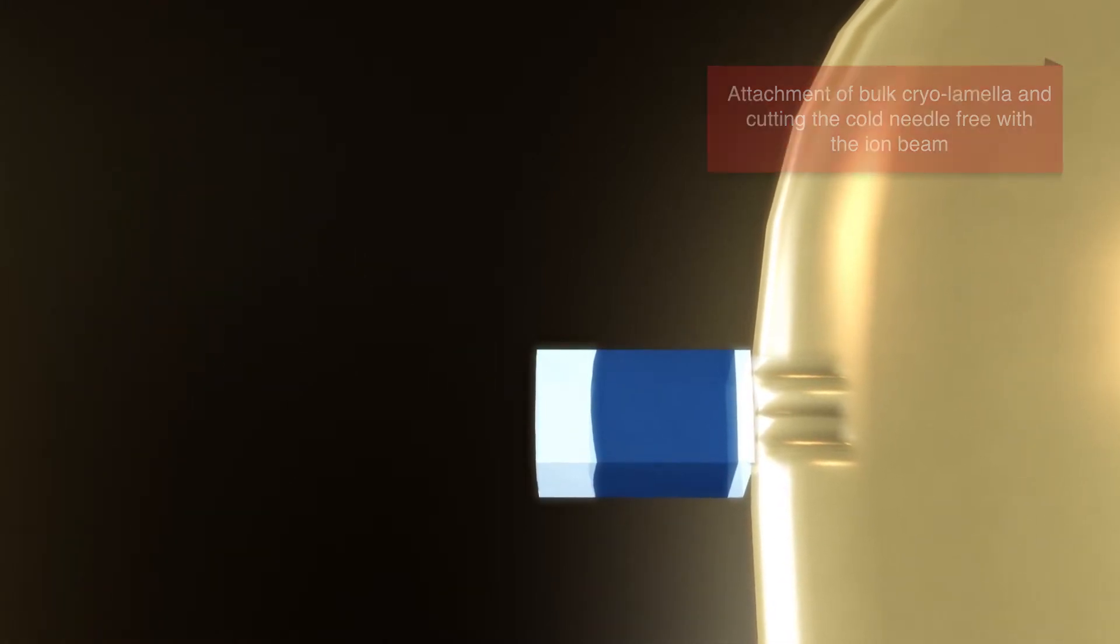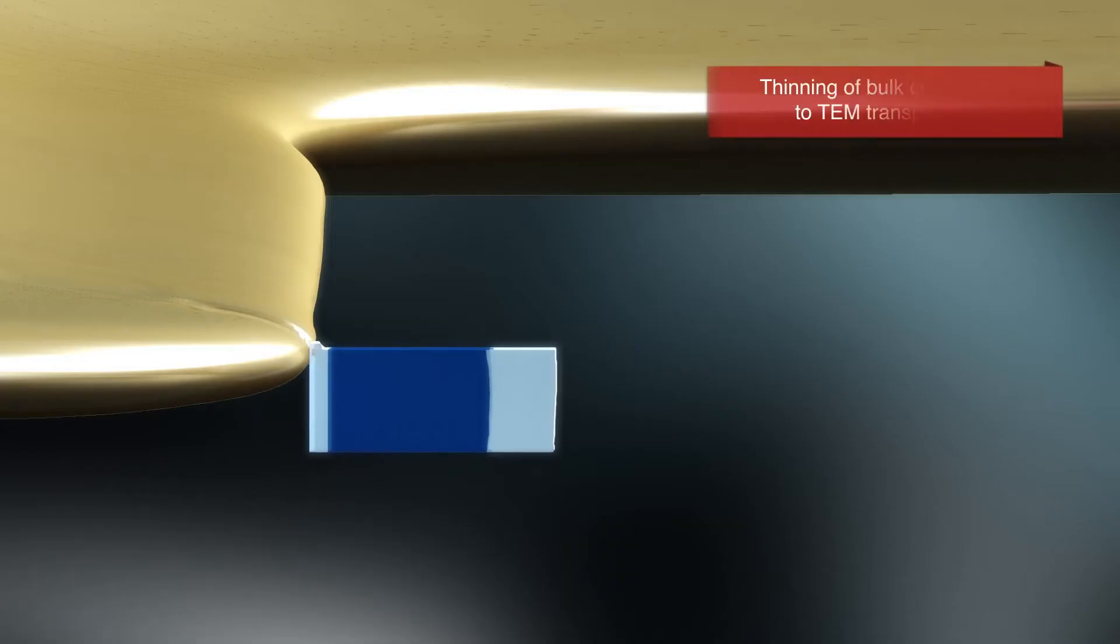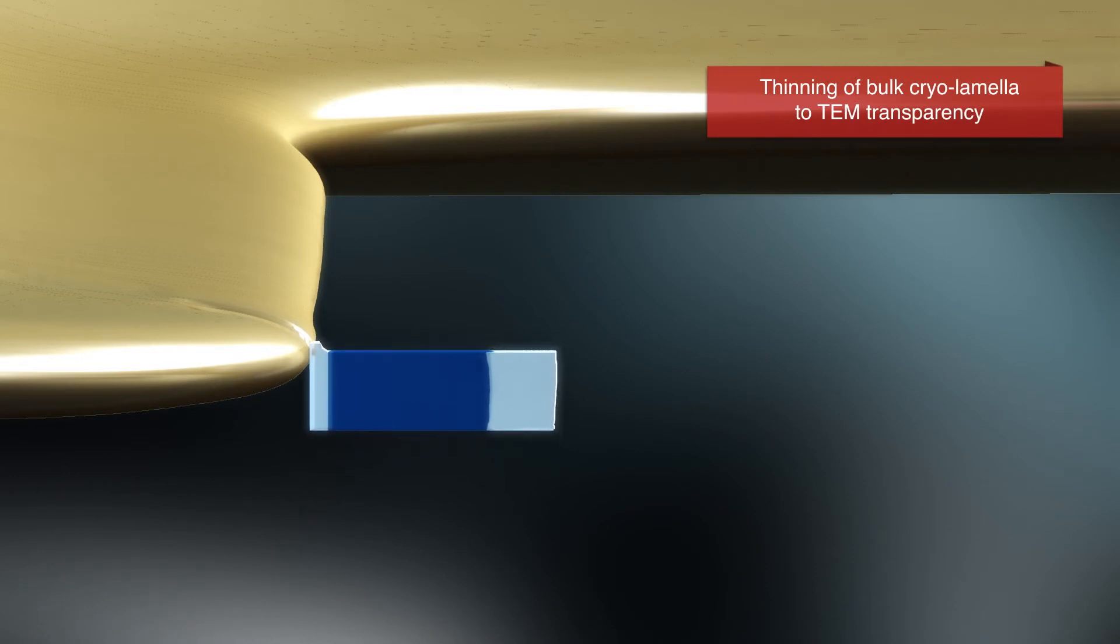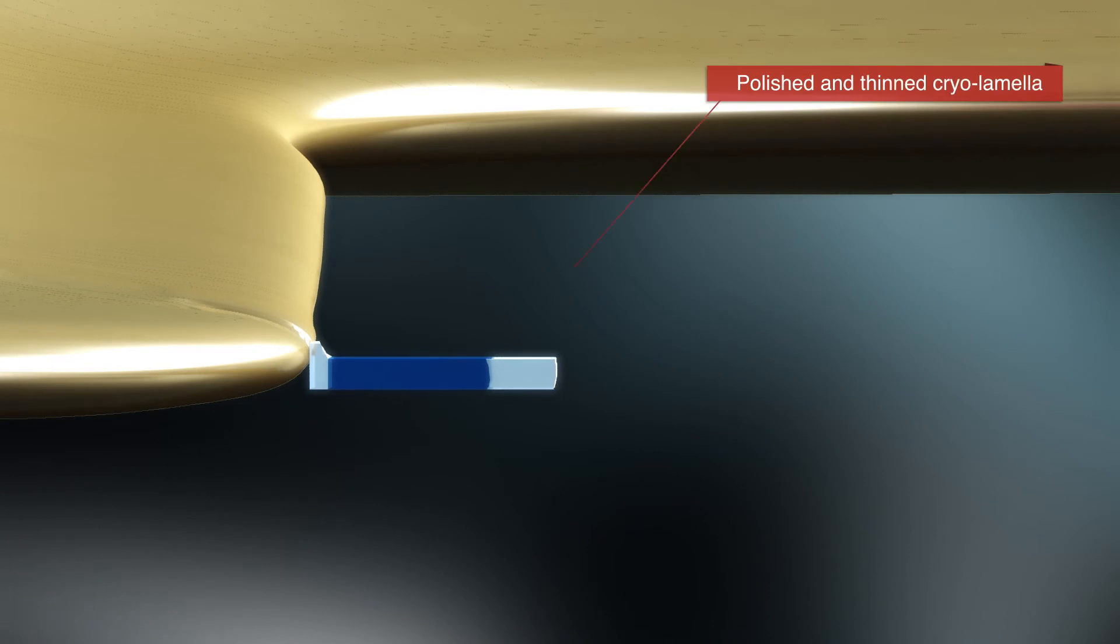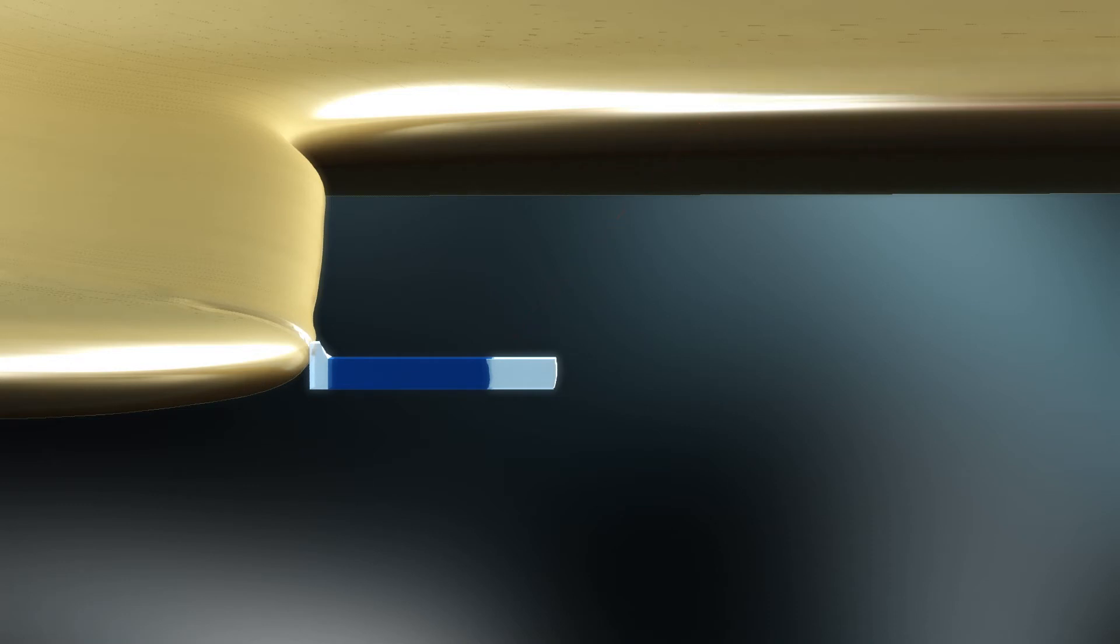For the last step, the bulk lamella sample is thinned down using the ion beam until it is about 200 nanometers thin. The frozen cell sample is now thin enough so that electrons can pass through during electron tomography acquisition.